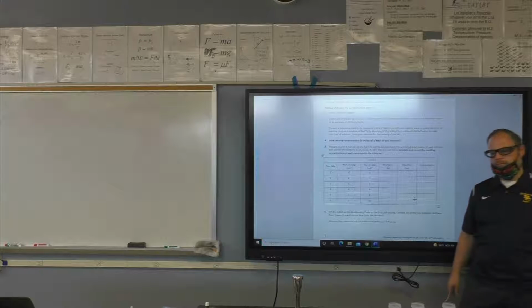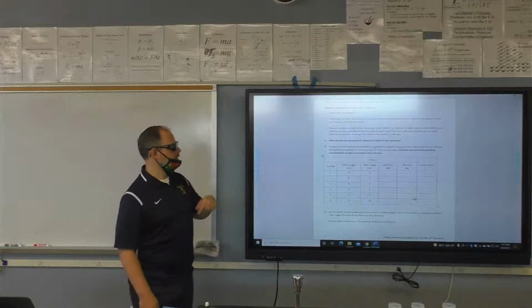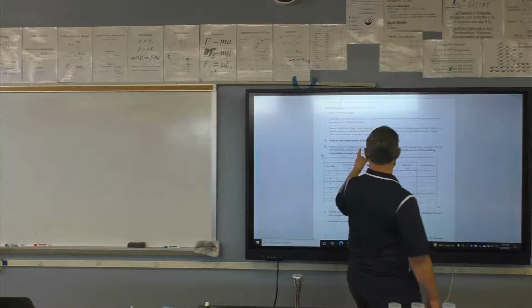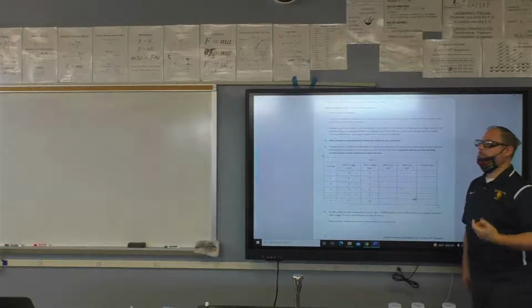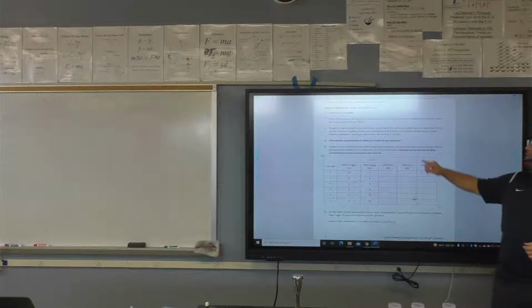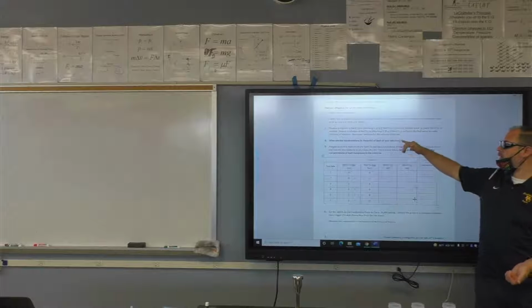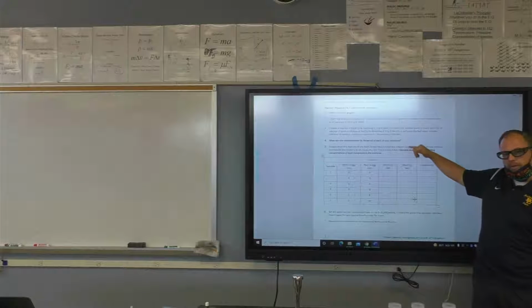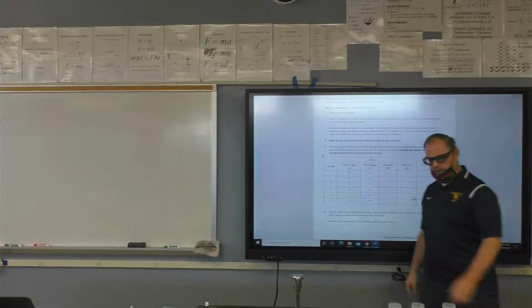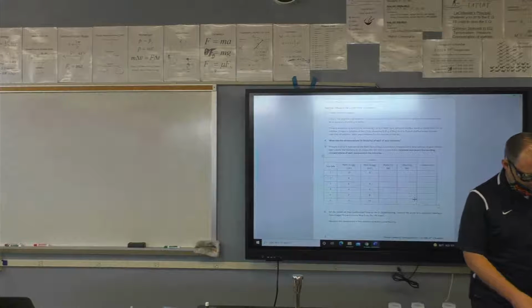Questions? So we're only doing the conductivity column right there? Yes. And then number 4, is that something we just calculate on paper? Yes, but you're working here too. So again, do number 4 when you can. And then at the end of class, we'll come back together and we'll go over it: did everybody get this? Okay, what does that mean for this? Okay, cool. All right, so go get your solutions made, get your conductivity done. One set is already right up here. You can take this if you want.